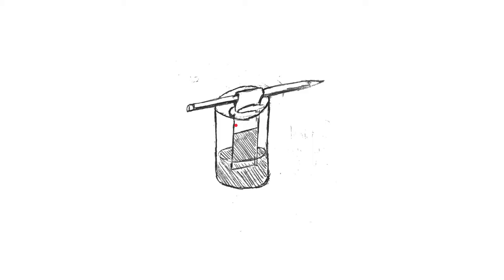So, let's zoom in on this piece of paper. Take a look at the image on the bottom left corner. This represents the paper. Notice this shape on it. That is the substance we will be analyzing. Let's say that our substance is a mixture made up of squares and triangles. What we want to do is to figure out the polarity of the square and the polarity of the triangle.